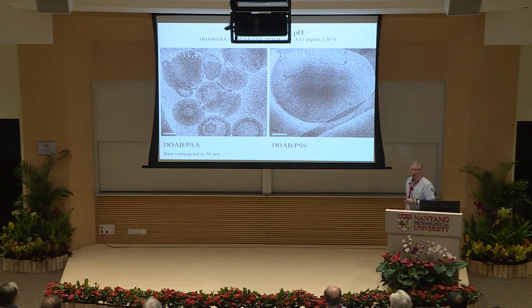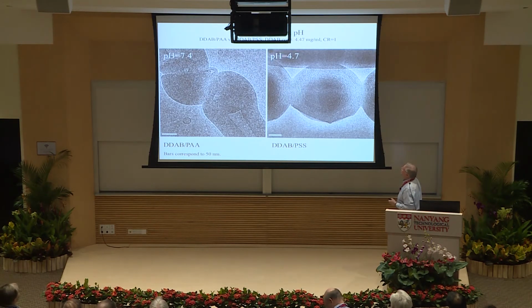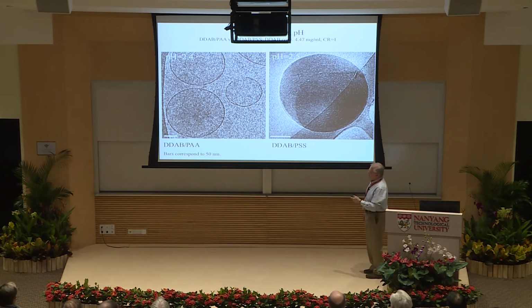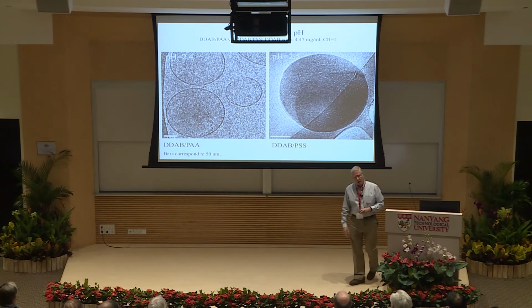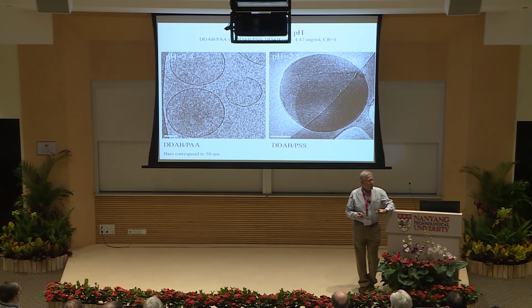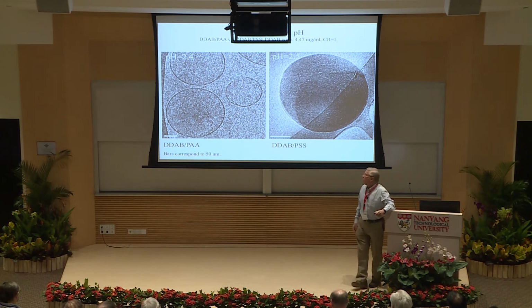And now let's look at the effect of pH of the solution. So we'll start with high values, and again, we get the same kind of structure. By now, you are used to it. Still above the pKa of the polyacrylic acid. And when we go down below the pKa of the polyacrylic acid, you can see very well that the lamellar structure has actually disappeared. More specifically, there's really no interaction between the two species.